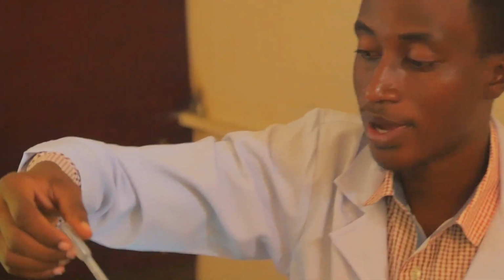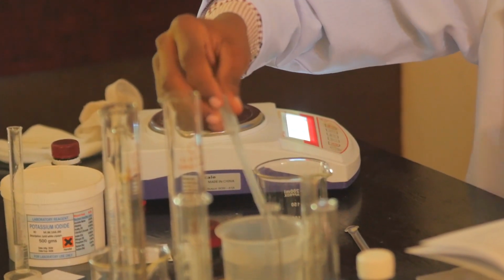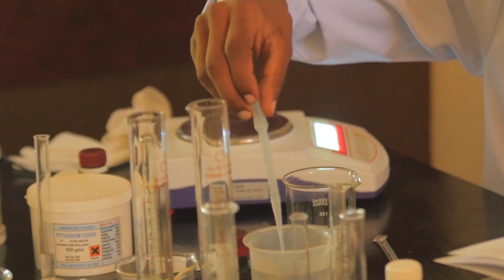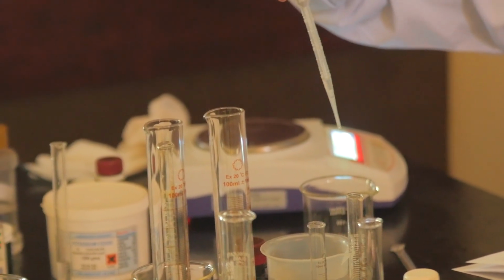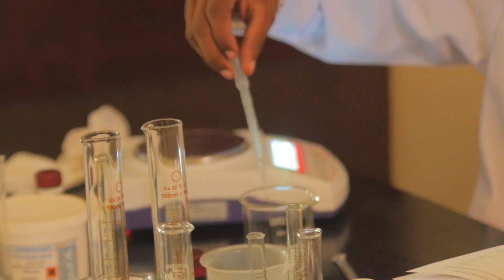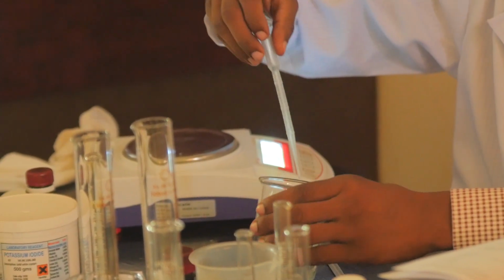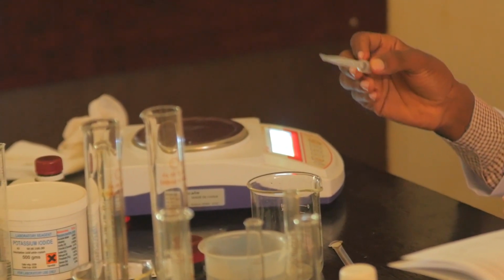Now I'm going to measure 0.5 mils of water. So I can use this dropper of mine to take purified water, 0.5 mils. So this is my purified water here. Yeah, using my dropper, this is 0.5. Okay, 0.5 mils of water.